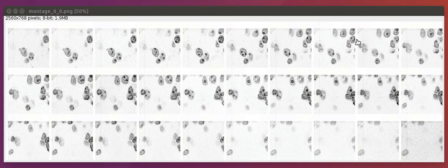And so as we continue to move, we'll see these objects become more and more into focus, and we should continue to use that three-dimensional context to identify, hey, this is object number 1, and over here, this is object number 2. Now, as things are really in focus, the separation between the objects becomes more and more clear until they start to fade away. Okay, so those are two examples of how you should use the three-dimensional context to segment the data.